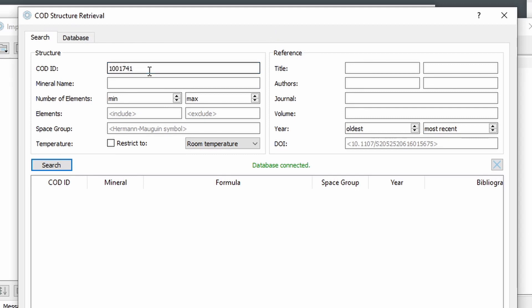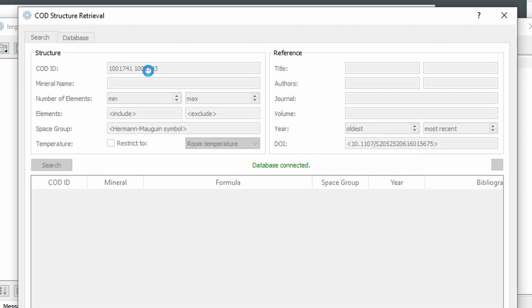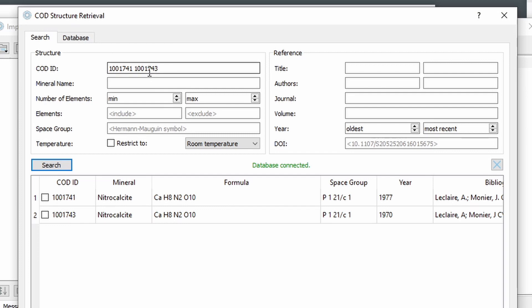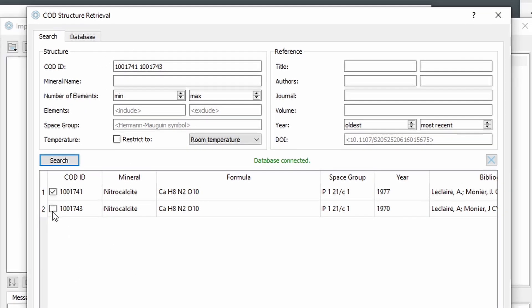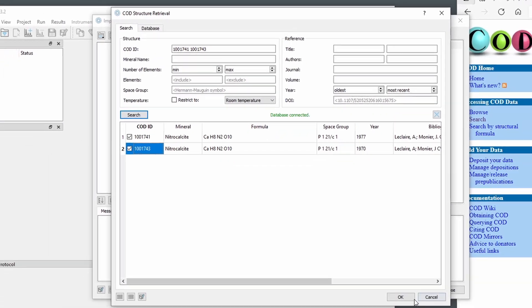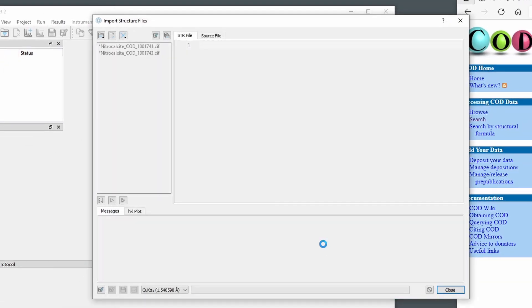And we can enter multiple ones separated by space character. And now it gives us exactly the entries we entered here. And we can select them and download.